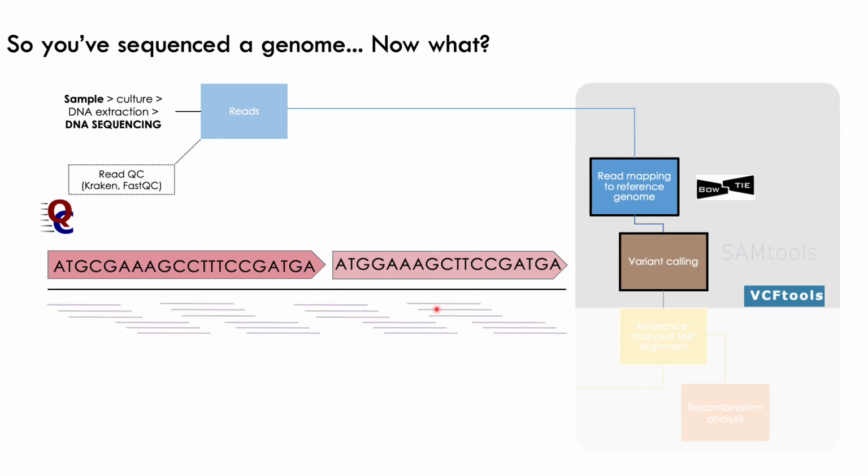And we're going to align one set of reads to it. So we've got the reads corresponding to the purple genome. And unlike in de novo assembly earlier, where we align all the reads to each other, we're aligning all of the reads to the reference in this case. Ideally, at each position, you will have reads that overlap with the reference, and you'll also have reads that overlap with each other. And that will give you confidence in the base called at each position.